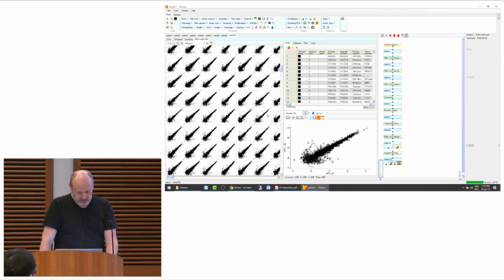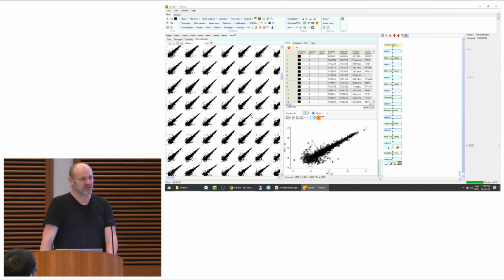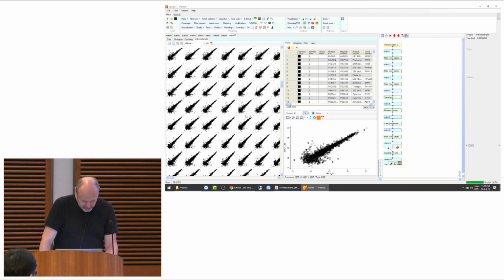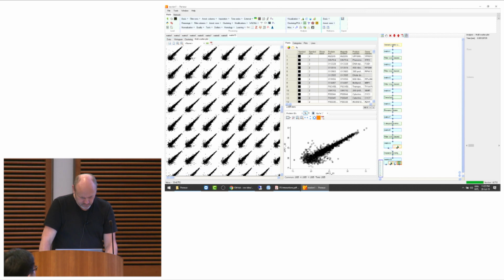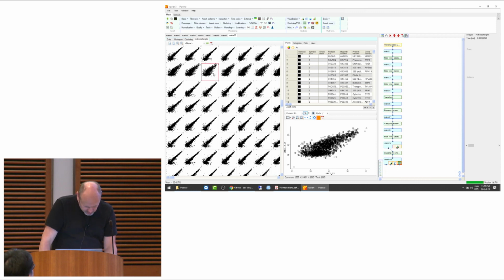So, but let's see if we also have outliers here, so outliers would be things that look very odd compared to the others now, as usual. So far, so good. Nothing special. Oh, what's that? This guy here looks odd, right? So the whole row looks odd. So there's some second population visible in the plot down here. And so which one is it? So it's actually again the same. So now that is the third evidence that there's something wrong with the sample.